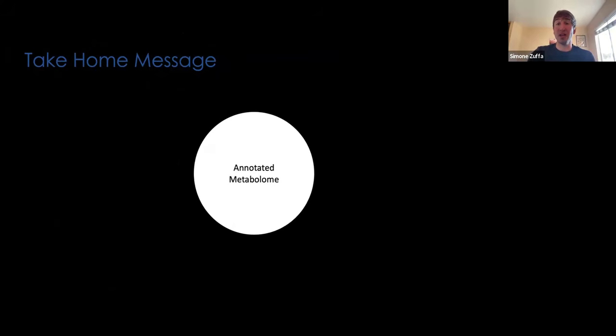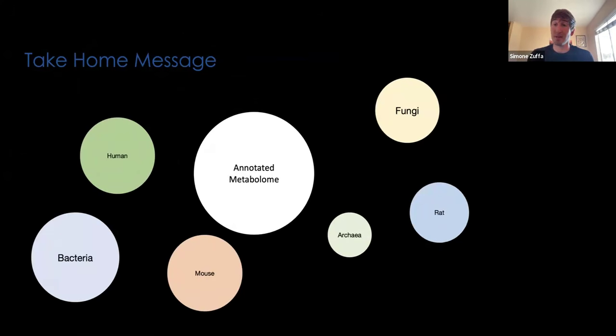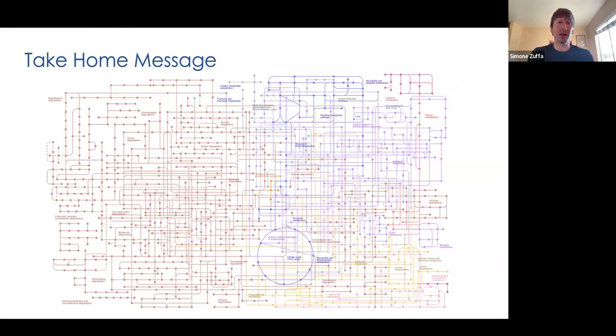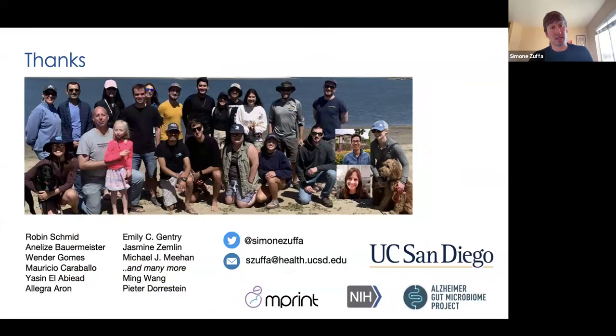But through annotation and hopefully through structured metadata, we can start making sense of it. Through MicrobeMASST, hopefully we will be able to help you pinpoint specific known or unknown molecules to specific bacteria, and help you design more mechanistic studies to pinpoint the metabolism of your bacteria of interest or your molecule of interest.